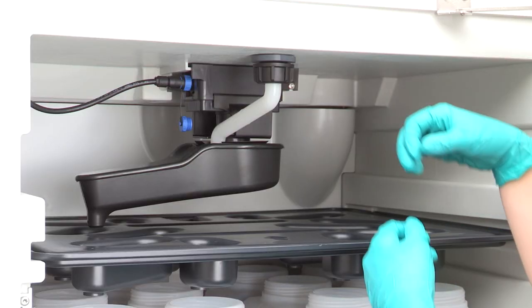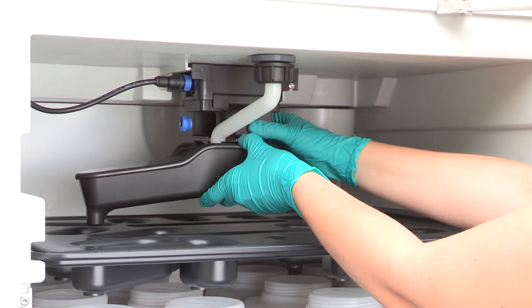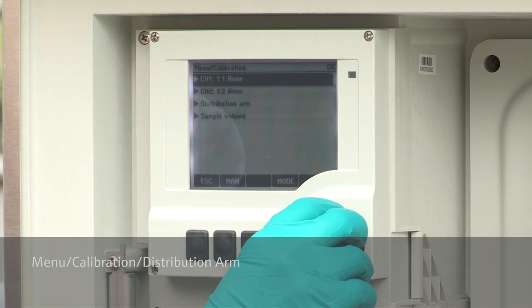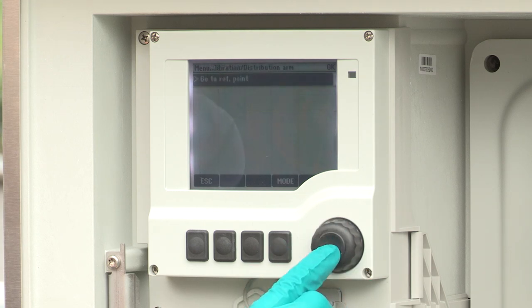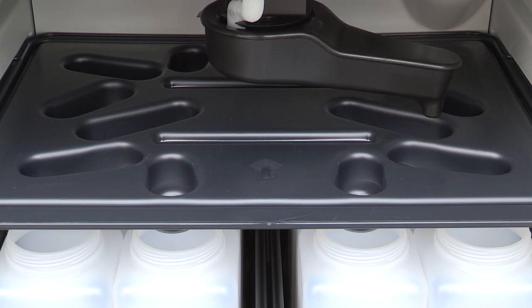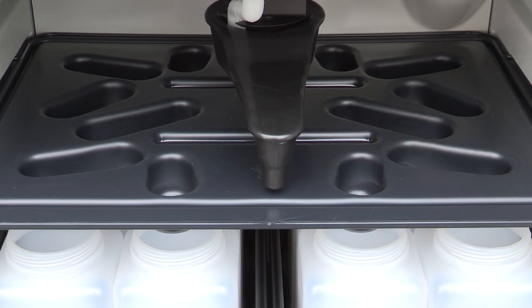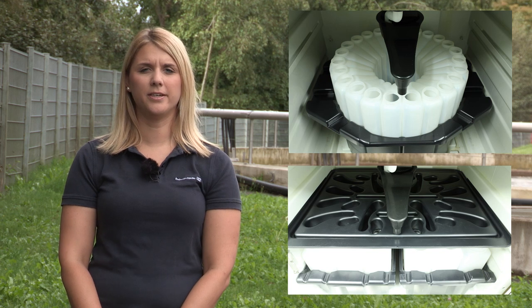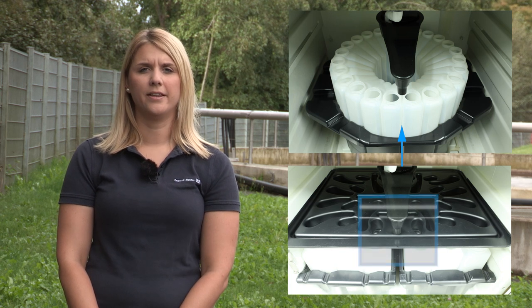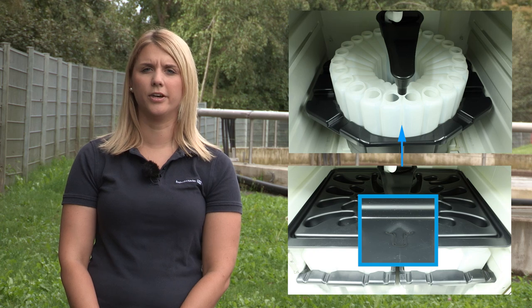The distribution arm is calibrated in the factory. However, it is recommended to verify the calibration during commissioning. Please verify that the distribution arm is sitting correctly in its holder before starting the calibration. To calibrate the distribution arm, go to menu, calibration, distribution arm, and select go to reference point. Wait until the distribution arm stops. For samplers with a direct distribution, the reference point is located at the front between the first and the last bottle. For samplers with a distribution plate, the reference point is marked with an arrow in the front of the distribution plate.